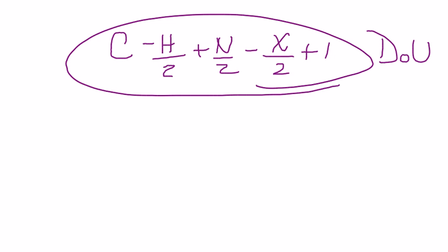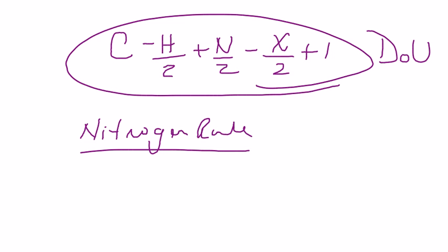And the other thing that I wanted to say was the nitrogen rule. According to it, compounds containing elements that are common in organic chemistry, so carbon, hydrogen, oxygen, silicon at times, phosphorus, nitrogen, of course, we are referring to those. For a molecule to have an odd numbered molecular weight, it must contain an odd number of nitrogen atoms. So if you have, let's say, 87, that means it can contain 1, 3, 5 nitrogen atoms.